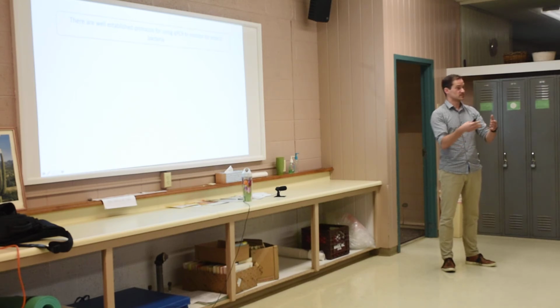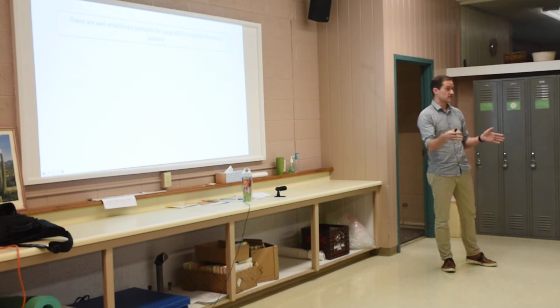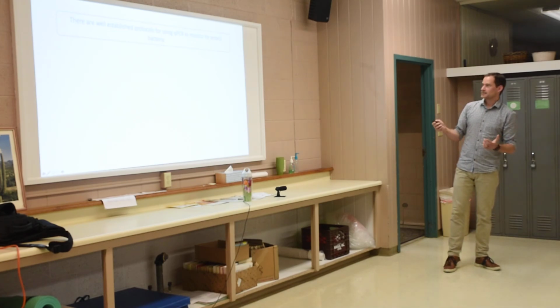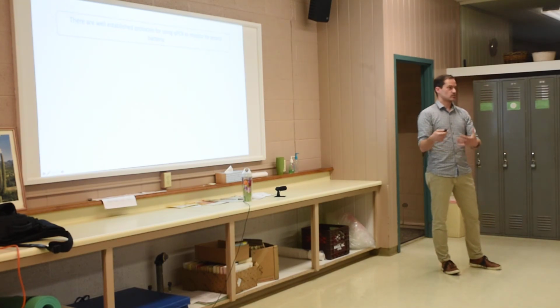So to kind of bring this into your question, you asked if there are these really established SOPs that can be followed for qPCR testing. The swimmer's itch ones, we're designing those because we're the only ones that are working on this. And so we're designing these species-specific tests, and we have to kind of get those SOPs up to a place where we're comfortable with them.